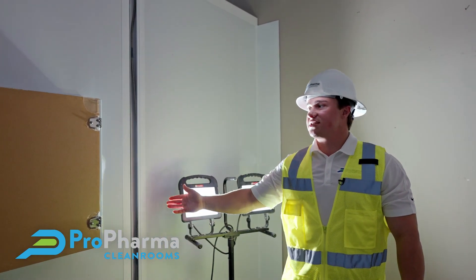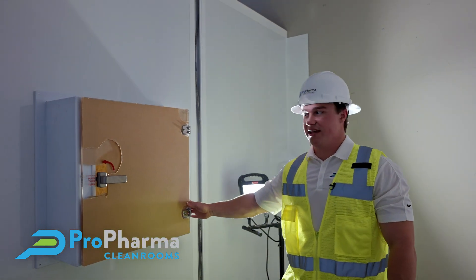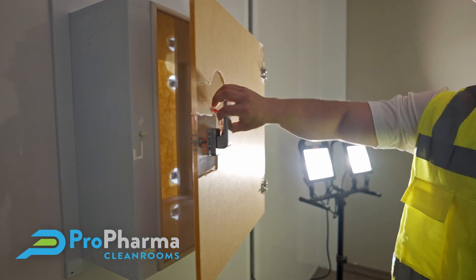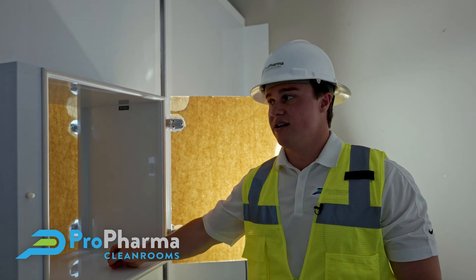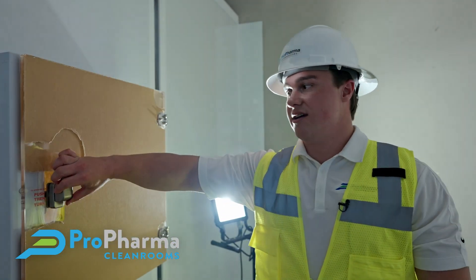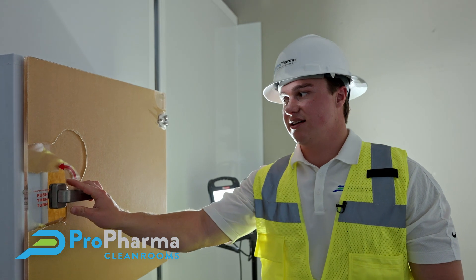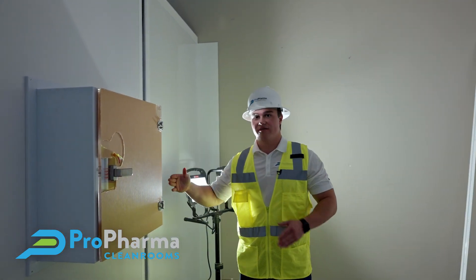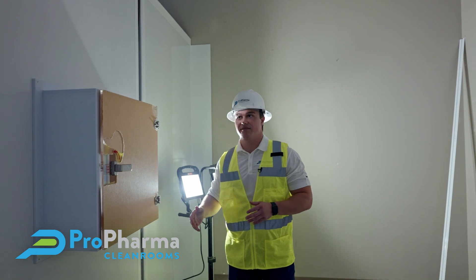Right here we've installed our pass-through, and the cool thing about these pass-throughs is they're interlocking. When you open this door and place your medicine here, you're not able to retrieve it from the other side until this door is closed and locked again. That helps maintain air cleanliness by preventing negative and positive pressure from mixing back and forth between rooms.